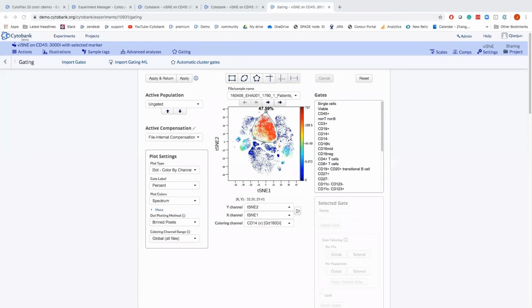So can we copy a seed function so that we can apply it to additional data? If we're doing a longitudinal study, such as in clinical trials, can we utilize the same seed function and basically replicate the same viSNE analysis?